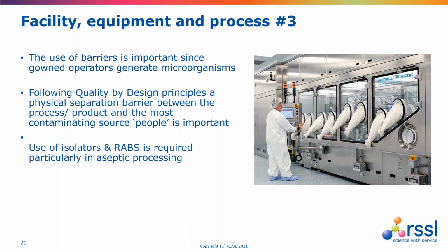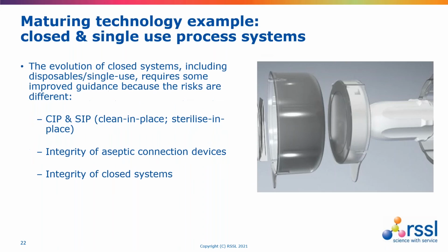We also need to find out where we can implement closed systems, such as single-use disposable sterile technology. And this would include things like aseptic connection devices. And we also need to be sure we can assess the integrity of closed systems as well.